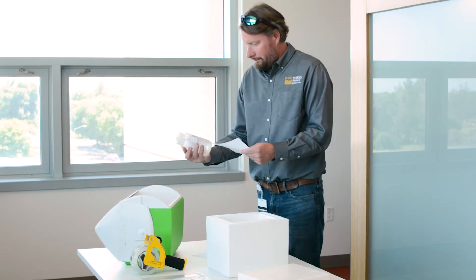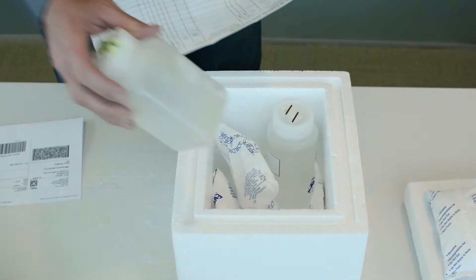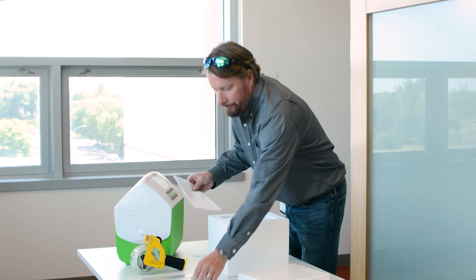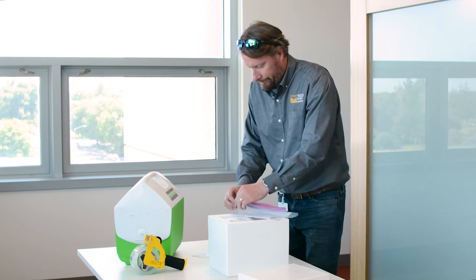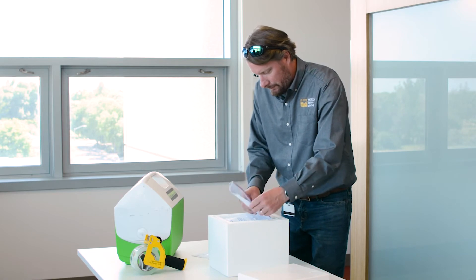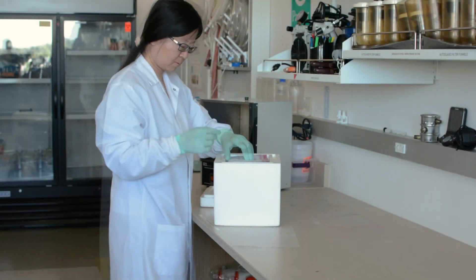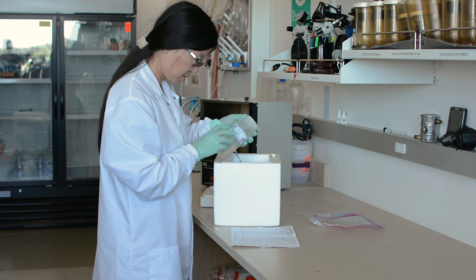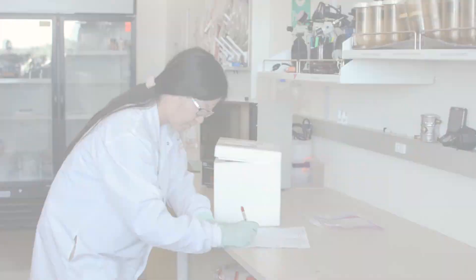Once all of the samples are collected in the field, they can be prepared for shipping to the lab. Every time the sample changes hands, the new recipient signs and takes custody of the samples. The lab results will be returned as soon as possible. And that's aseptic water sampling for E. coli.